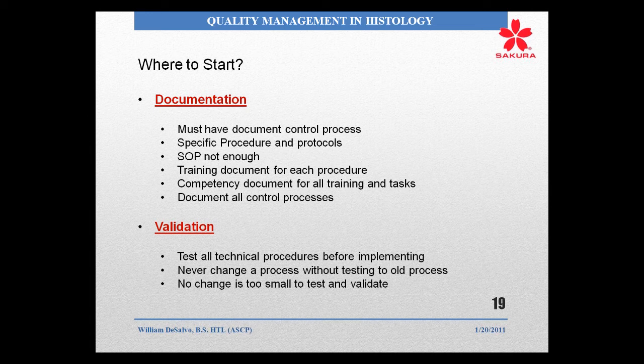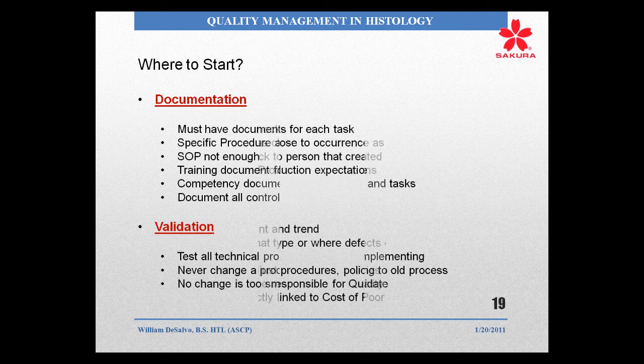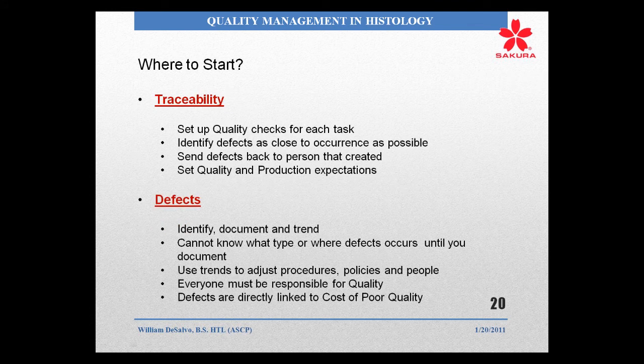You never change a process without testing it against the old process, and no change is too small to test or validate. Again, if somebody swaps out a different bottle of hematoxylin in your stainer, that needs to be tested before you put that into implementation. Your traceability: this is very, very important.